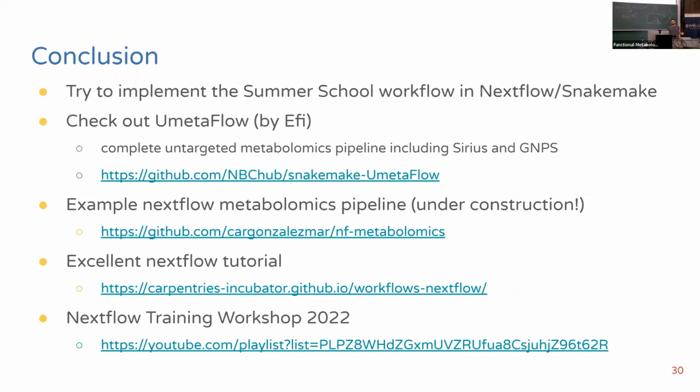And you could have an expert level where you modify the parameters file, or an easier mode, right? That's also possible. Is there a good community for these kinds of things, people putting it on GitHub? I can just pull it from GitHub, because I have no idea what you just did, but I probably could work it out if I stared at it long enough. Yeah, and use it. So nf-core is the way to go there, I would say, because the workflows are so well documented and easy to use that to execute them you don't need any special knowledge. And you could learn from that as well to build your own.